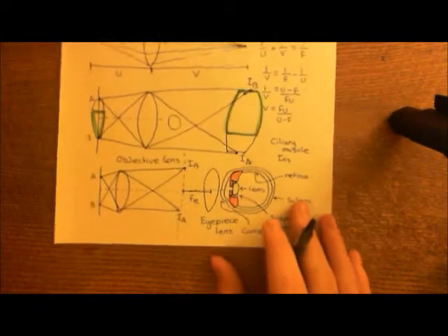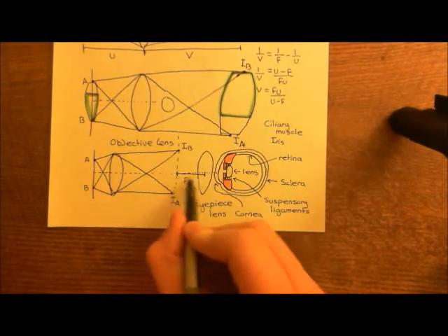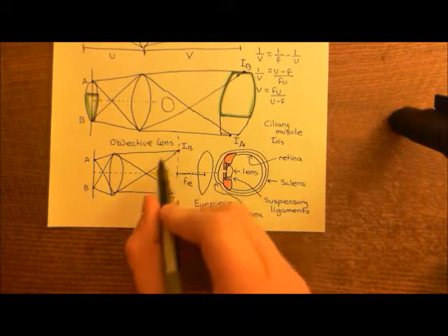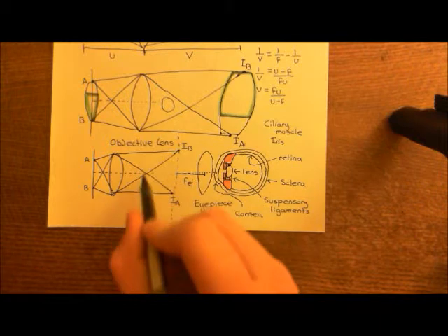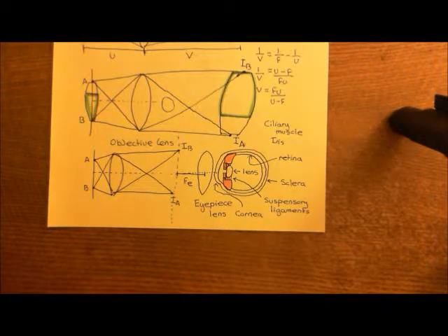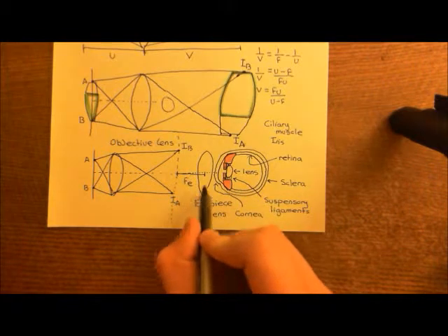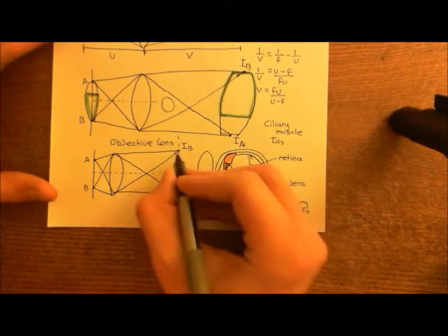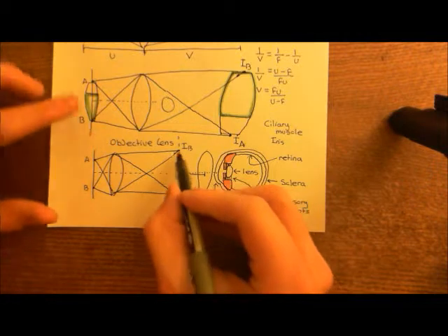So we have moved this lens to the position where this imaginary plane that we've got here, where the magnified image is being brought into focus. We have now moved the eyepiece lens so that it is its focal length away from that plane. And of course, what's now going to happen is that exactly the process that I have just described is going to happen for these points.